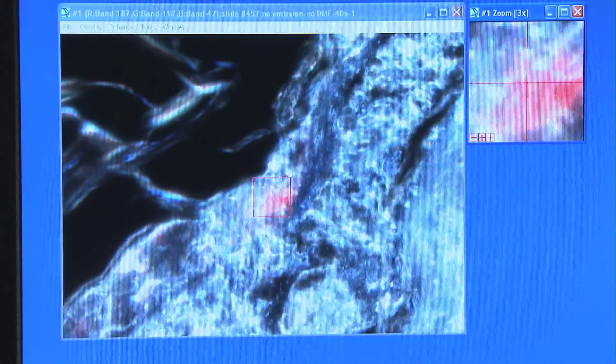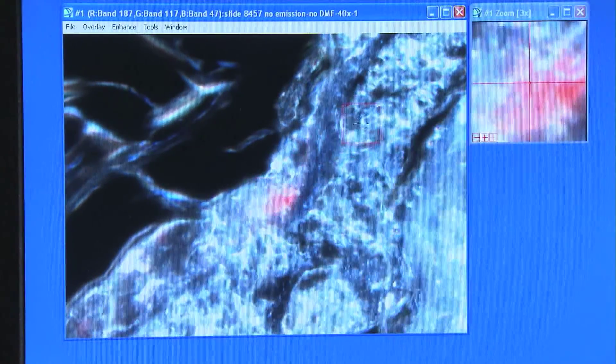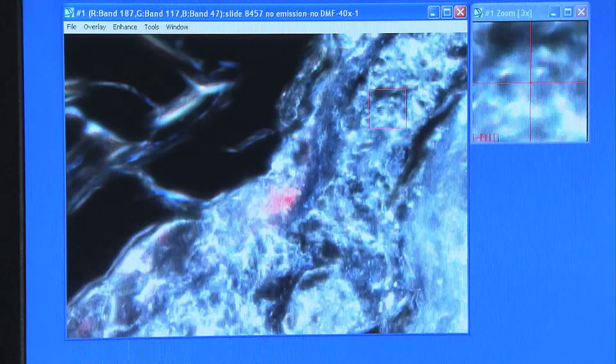The CytoViva hyperspectral microscope can be used to confirm the presence and location of nanoscale elements as they interact with live cells, tissue, or composite materials.